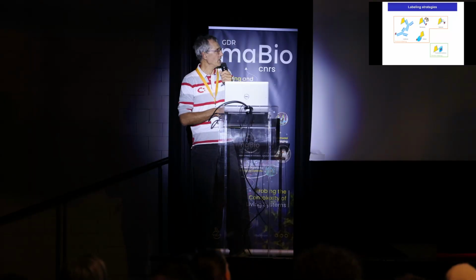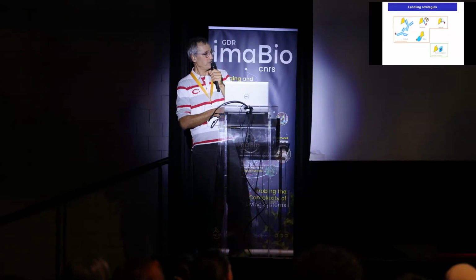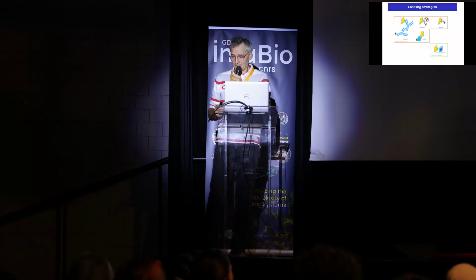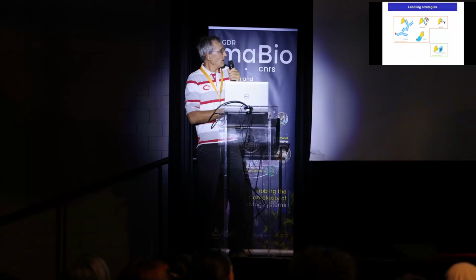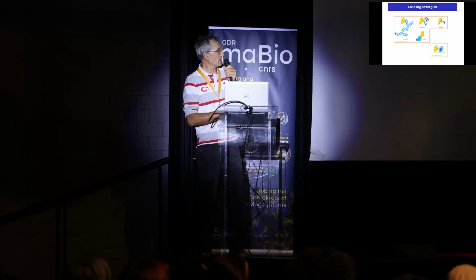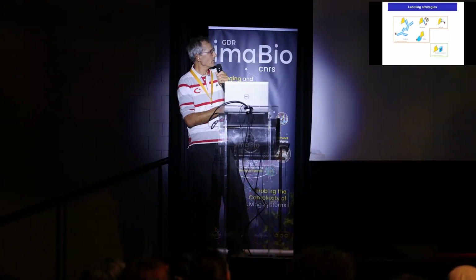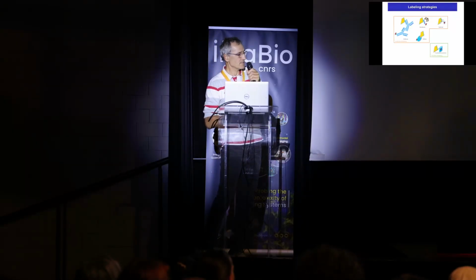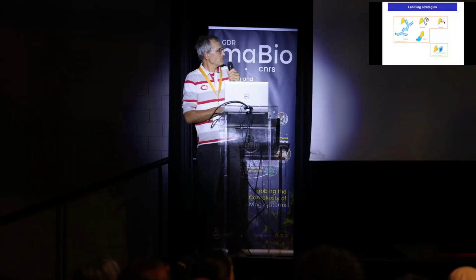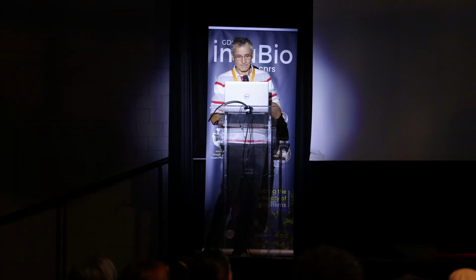So that's very widespread, but it's also not that good because this is really huge and the fluorophore ends up being very far from the targets. So it's certainly not the best idea for super resolution. So people have turned to Llama and Camelidae single chain antibodies, and they come up with nanobodies, which are much smaller. And some people also have developed very nice RNA-based antibodies, we could say, called aptamers or affimers. So a lot of different options.